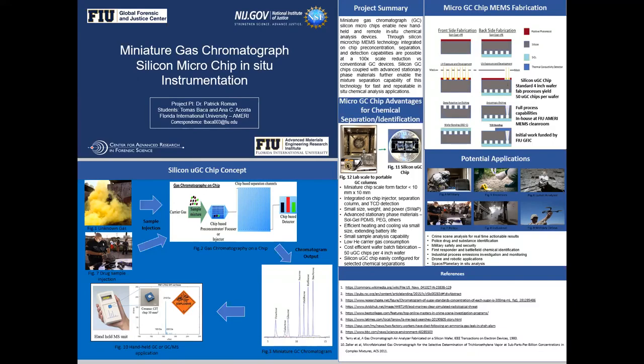The main differences involve the design outlined on the photolithography mask, the type of etching, and the thermal conductivity detector bonding. The design this time around is just feed-through holes for the inlet and outlet. The holes are anisotropically etched all the way through the wafer to connect with the inlet and outlet ends of the column. Finally, the TCD is bonded to the outer hole. The TCD is separately batch fabricated through similar MEMS techniques.